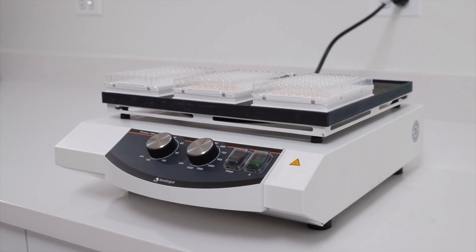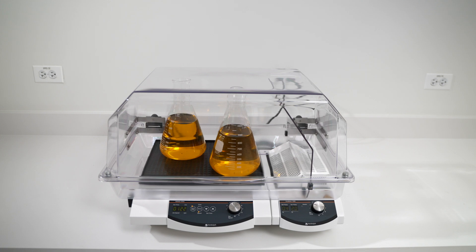Like the other two models, the Titramax 1000 also comes with a built-in timer. However, unlike the other two Titramax models, the Titramax 1000 has the capability to integrate with our modular incubation system. This transforms a regular platform shaker into a platform shaker suitable for most temperature control tasks.